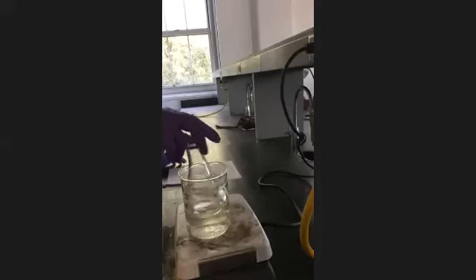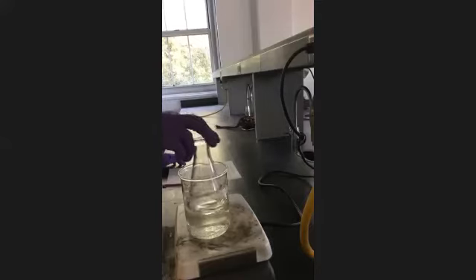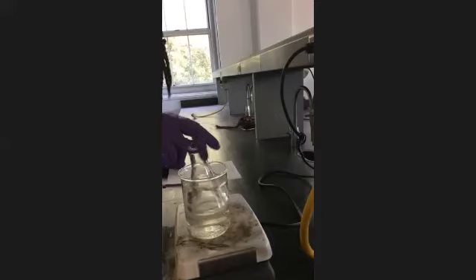So just keep swirling. You want it to go clear. When you swirl it, keep watching it, make sure that everything goes in solution.